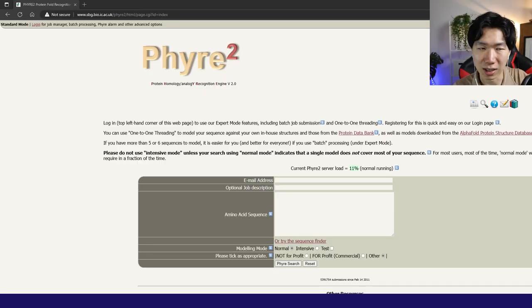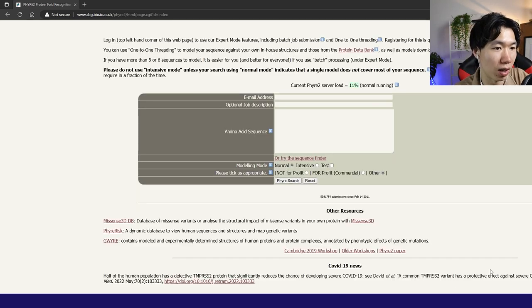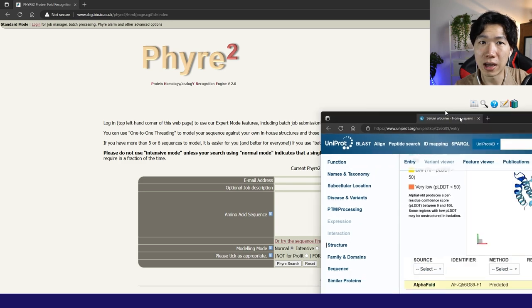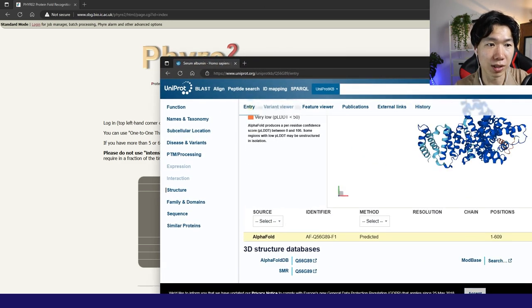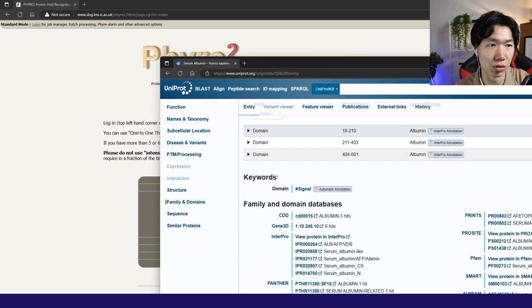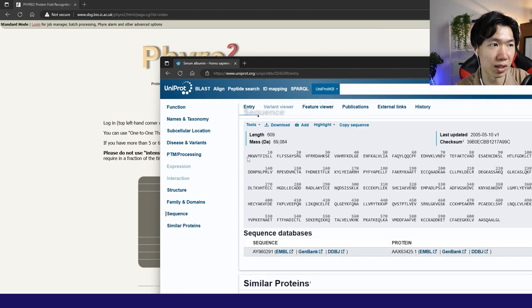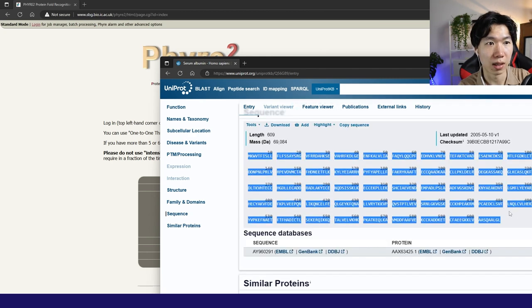This is the platform that we're going to use. It's called Phyre2. It was developed by the Imperial College of London. If you have an amino acid sequence, I will use albumin as an example. This is the amino sequence of the albumin.